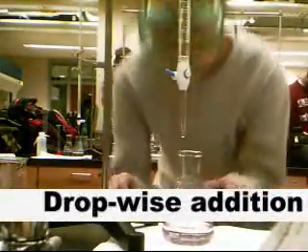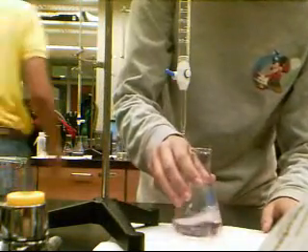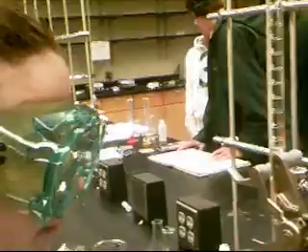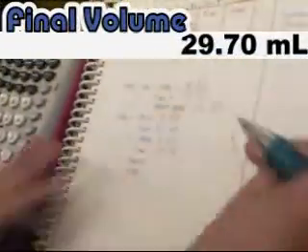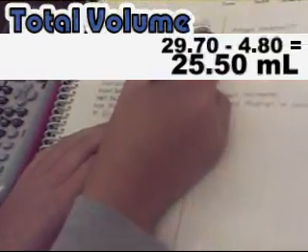To perform the dropwise addition, we will add the NaOH one drop at a time in order to determine the exact moment when the solution reaches the endpoint. When the solution turns light pink and holds its color for 10 seconds, record the final volume, which in this case is 29.70 mL. Calculate the total volume of titrant added to the flask. Our total volume is 25.50 mL.